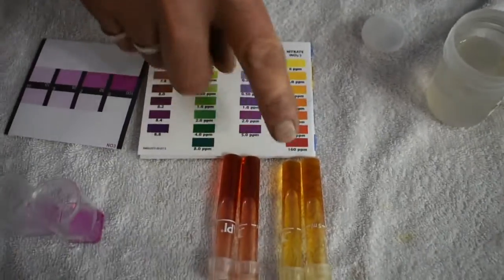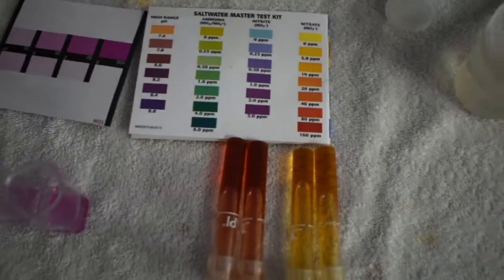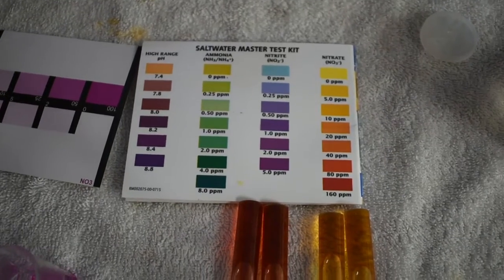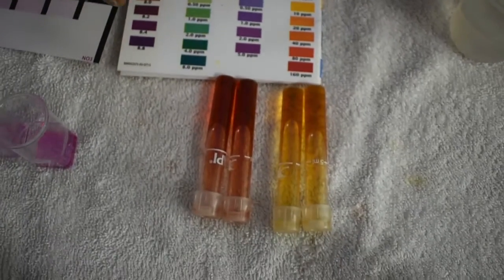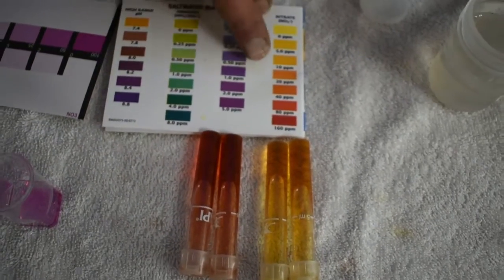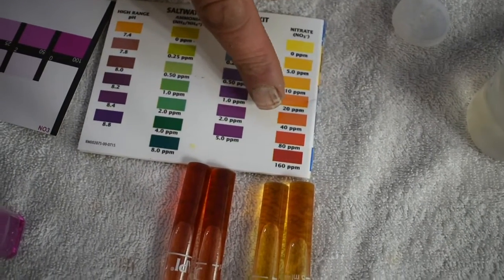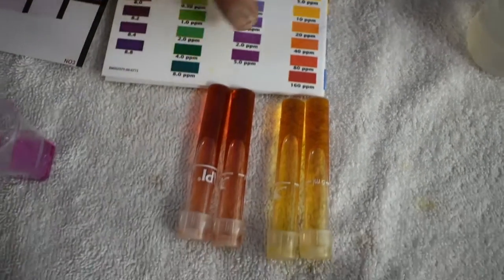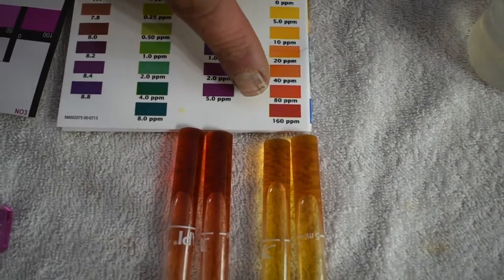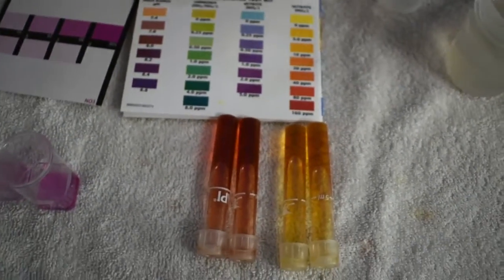I ran two tests on the API with each one just to show one important factor with these test kits — is it going to be consistent from test to test? Both tests came up almost identical. On this one we're maybe in the twenty to forty parts per million range, and on this one we're running maybe over a hundred parts per million.